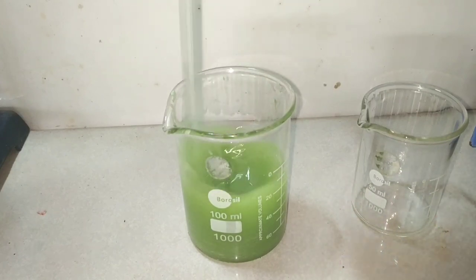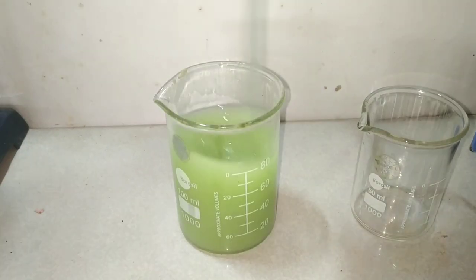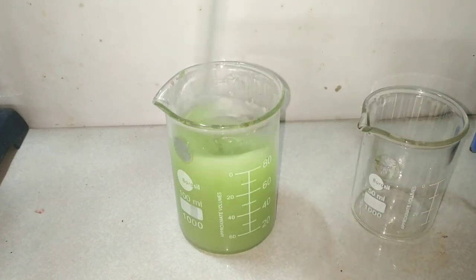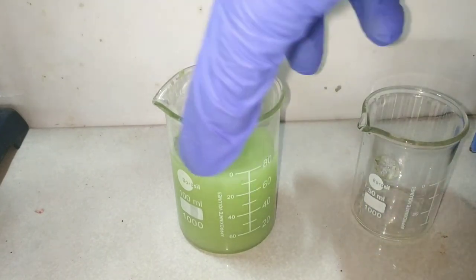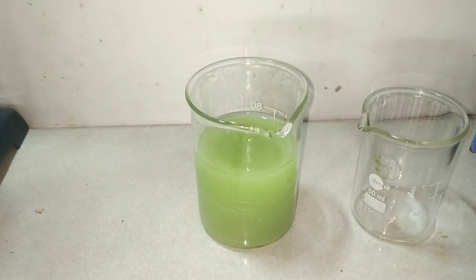You can clearly make out a white suspension in the solution now, and that's copper 1 chloride being formed. After stirring for a while, allow it to sit undisturbed. Immediately, you see the white precipitate depositing at the bottom of the beaker.